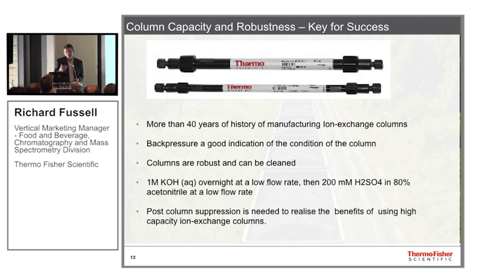And I mentioned to you about the cleaning of the columns. Should the columns get contaminated, which they inevitably will, they're so robust that they can be cleaned. I've got experience of cleaning these columns many, many times, and you do not lose any resolution on the columns. They are extremely robust.